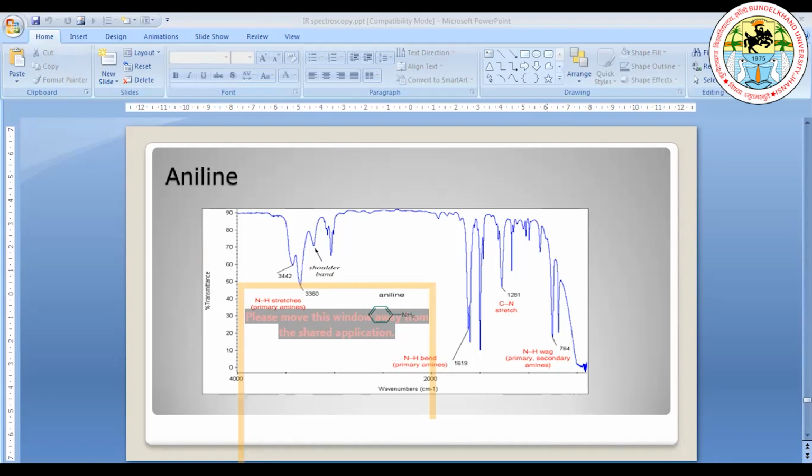I would like to share this spectra, that how you basically implement this IR spectroscopic tool, with the help of this you can be able to understand. Suppose I would like to say that there are three samples: sample A having molecular formula C8H10, sample B having molecular formula C8H10 again, and sample C having molecular formula C8H10 again. So, if I would like to ask, how will you differentiate on the basis of IR spectra that which form of spectra belongs to which one?